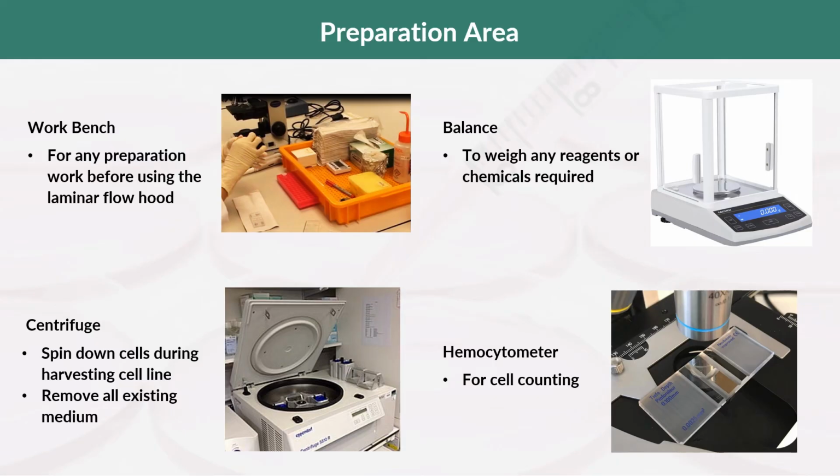For our case, we use the adapters that can adapt to the standard 15 mil tubes or the 50 mil tubes. Okay, and they also have the refrigerated versions, because sometimes when you centrifuge for a long period of time, heat is created. Okay, so you do not want that heat to affect your cells, so you have the refrigerated versions to control the temperature within the centrifuge.